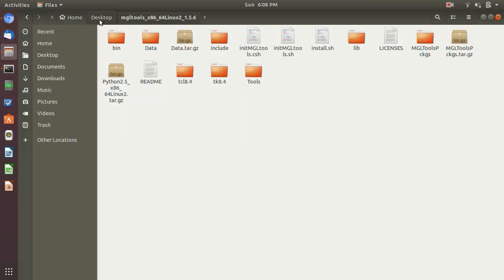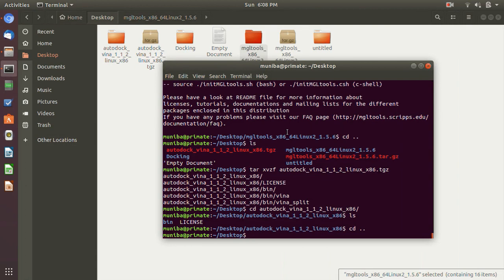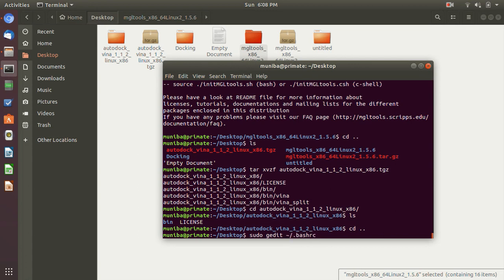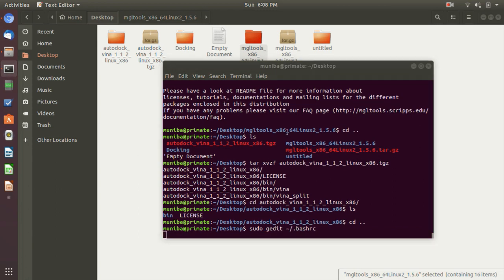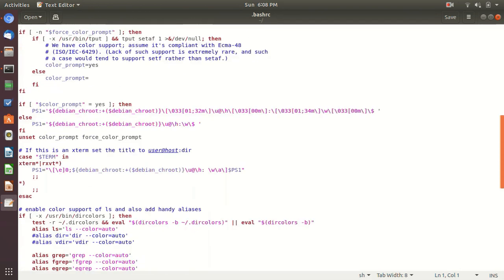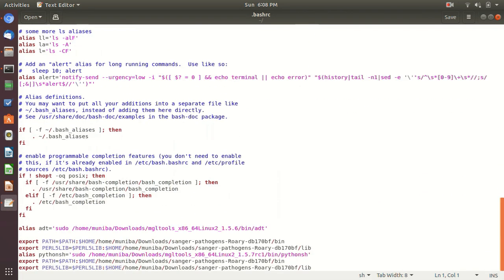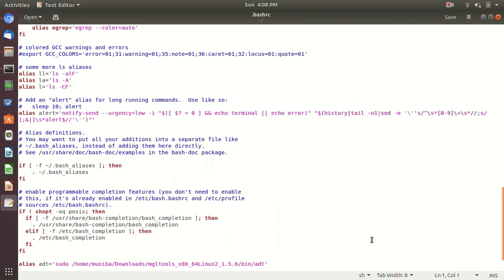So let's go back here and type sudo gedit slash dot bash RC. Okay, go to the end of the file. Yes, here you will find this. This is what you have to type: alias.